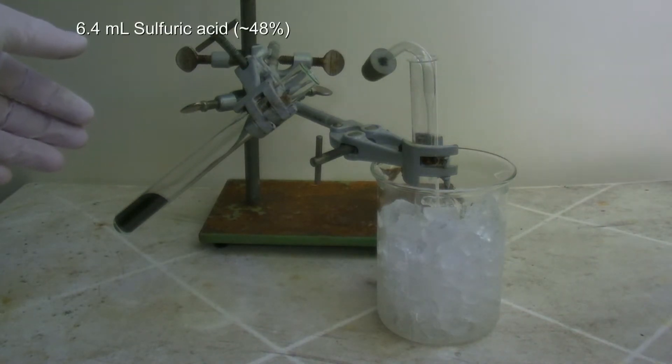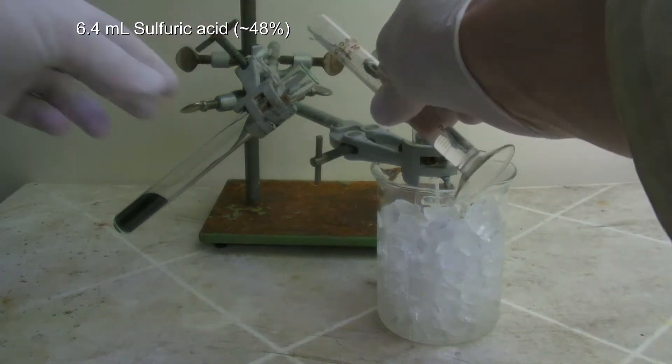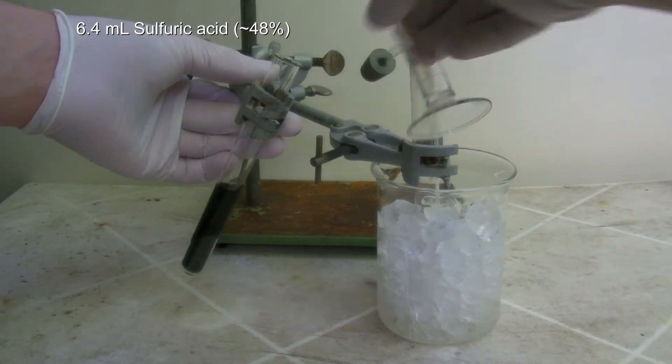Then 6.4 milliliters of sulfuric acid with a concentration of around 48% is added and the test tube is closed immediately.